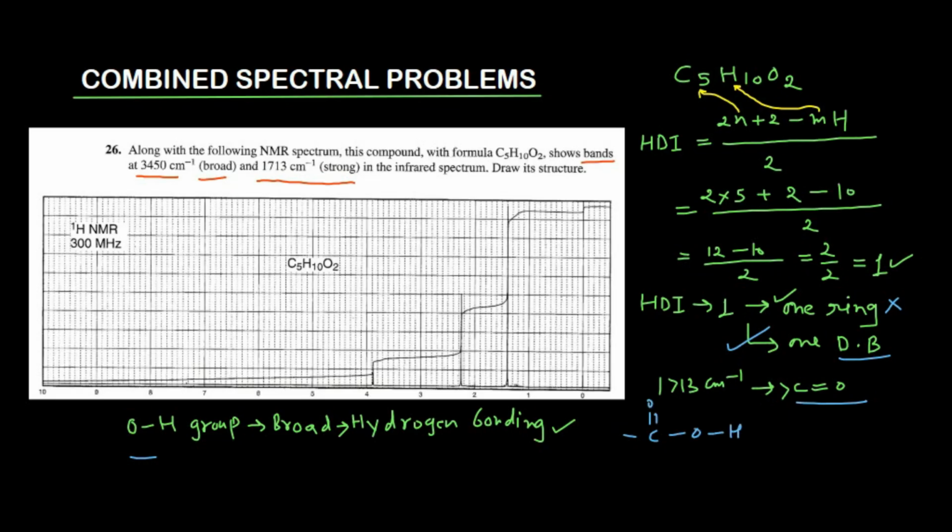Okay, but please remember, if an acidic group is present in the molecule, then this hydrogen in the proton NMR spectrum, in the 1H NMR spectrum, will resonate between 10 to 12 ppm. That means if it is the hydrogen of your acidic functionality, then there must be a signal between 10 to 12 ppm, corresponding to an integration of 1. But this information is not here in the picture. That means you can safely discard this possibility of acid in this case.